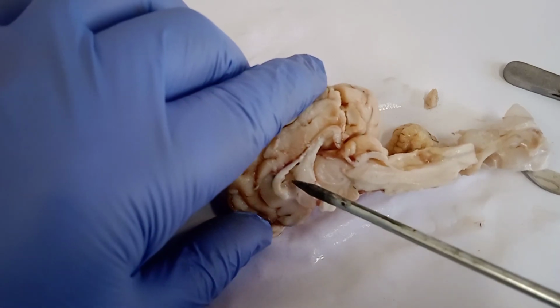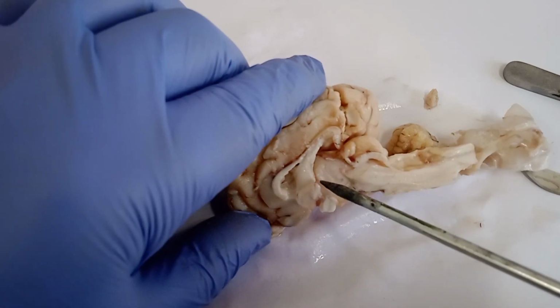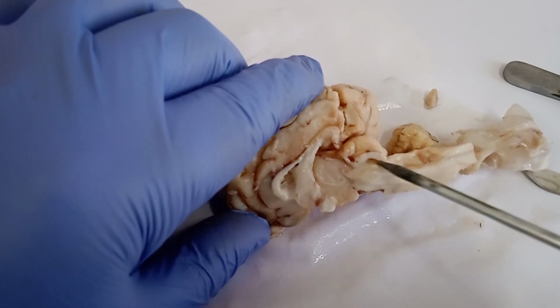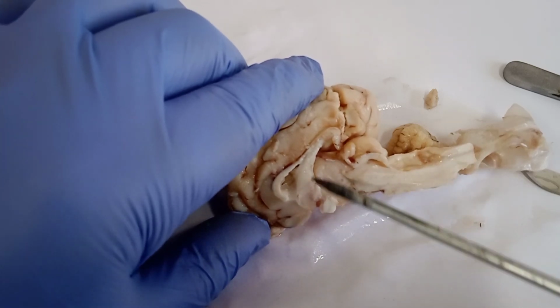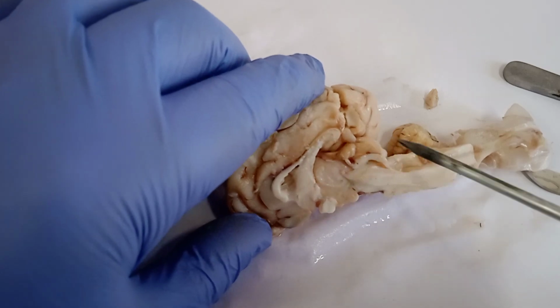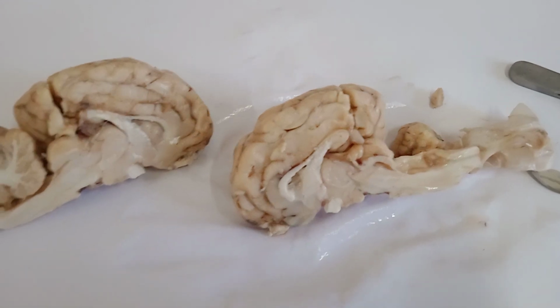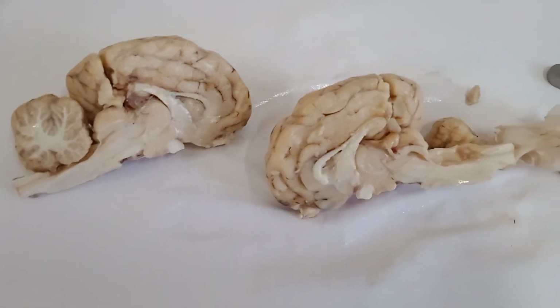So all these will be communicating: the lateral with the third, the third with the fourth, and the fourth with the spinal canal, and the spinal CSF will be circulating like that. So these are some of the features when you are going to dissect the brain. There is more to come in the coming lectures.